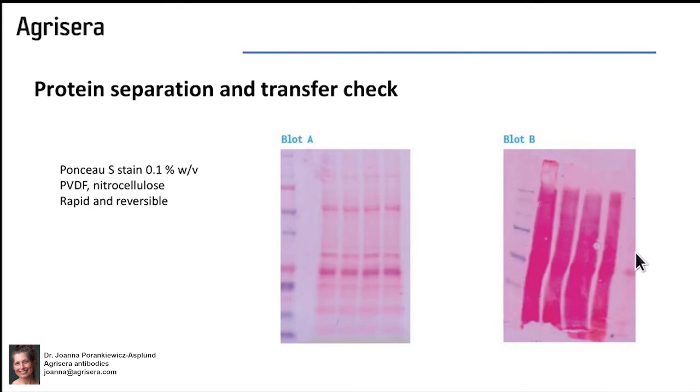In this case, I wouldn't recommend to continue with the western blot procedure, as we can see that there is a problem with protein separation.